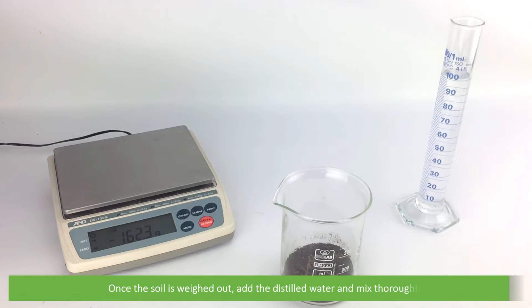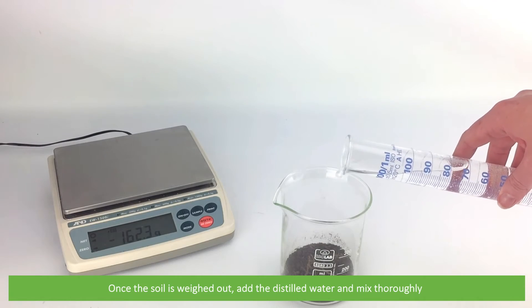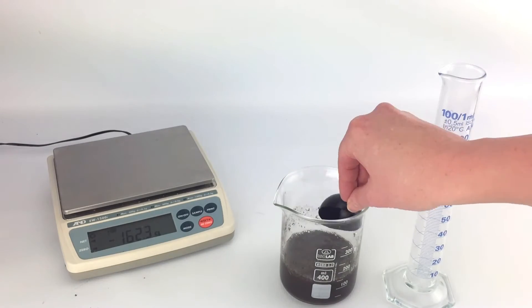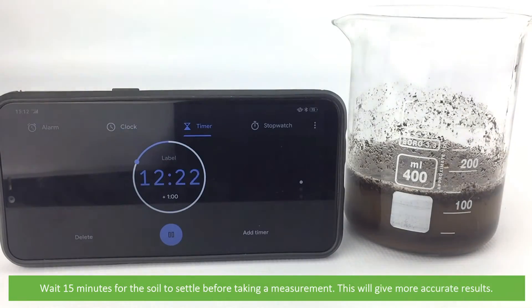Once the soil is weighed out, add the distilled water and mix thoroughly. Wait 15 minutes for the soil to settle before taking a measurement. This will give more accurate results.